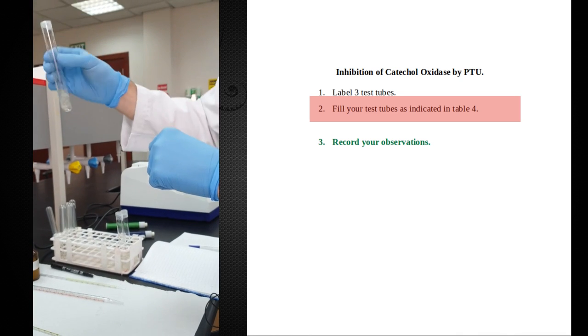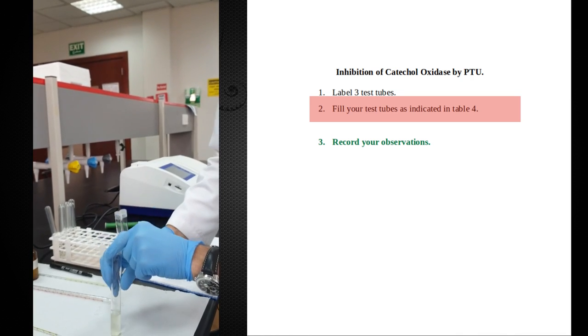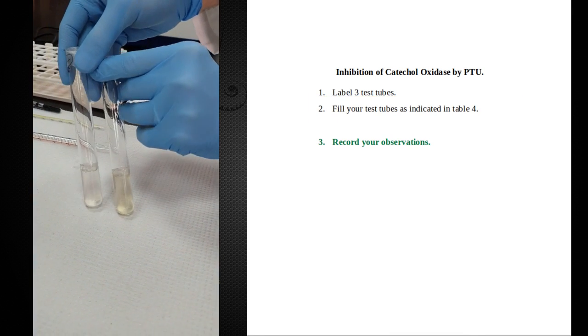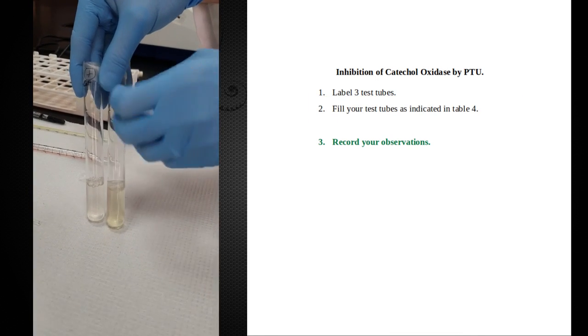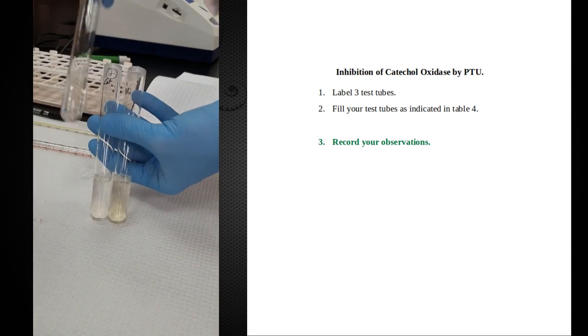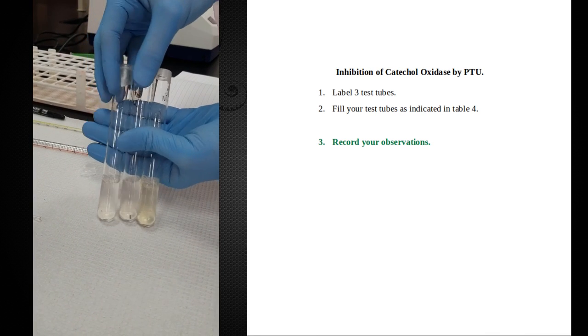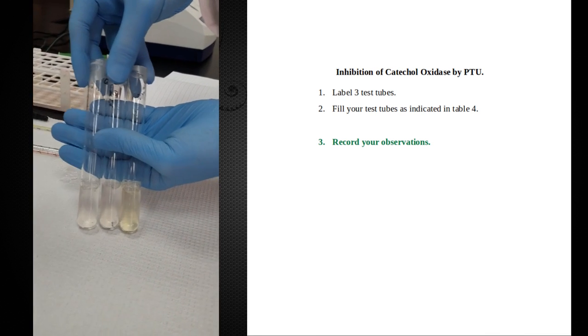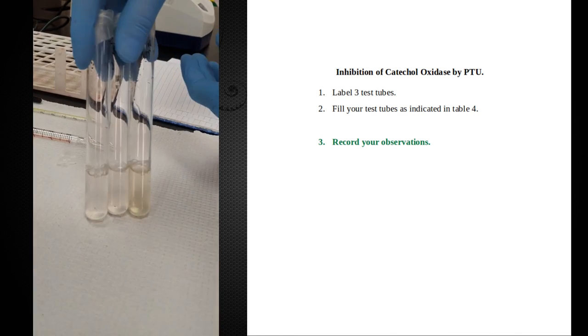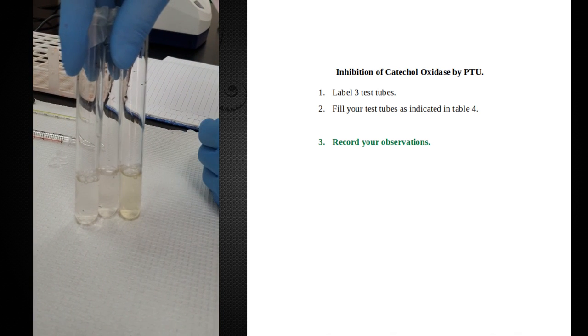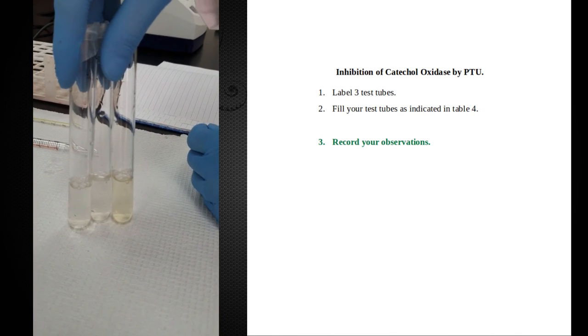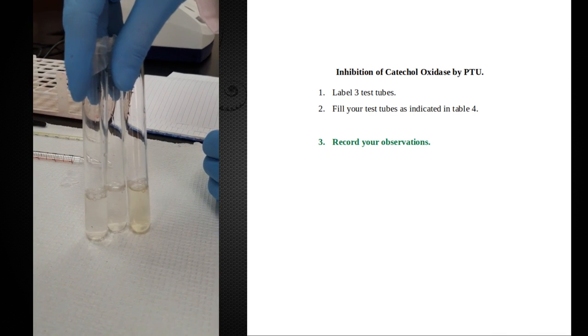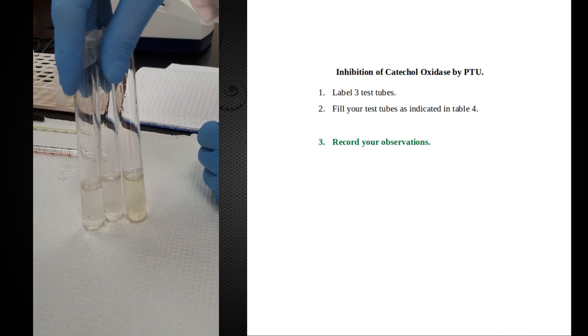A very small amount of this goes a long way. One thing you'll notice is that there's a color difference already. Can you see that? There's starting to be a color difference between the test tubes. We're going to give this a little bit of time, maybe five minutes or so, to allow the color to more fully develop. Then we'll come back and take a look at the results.